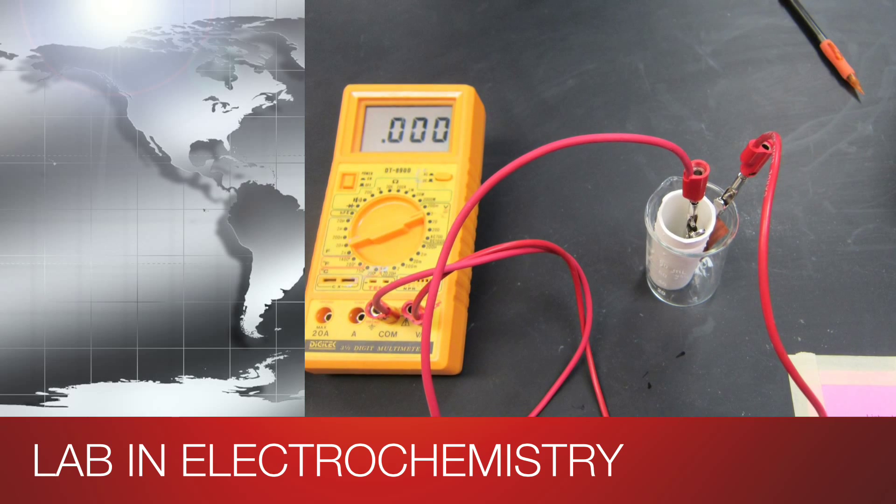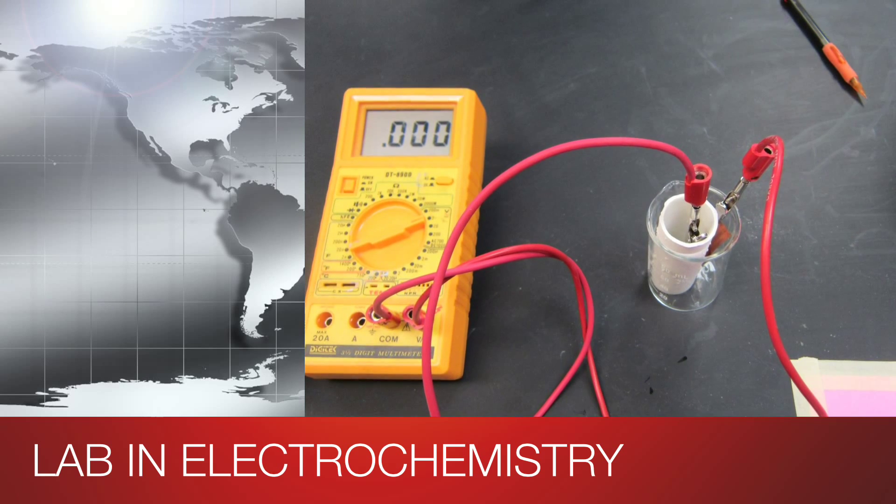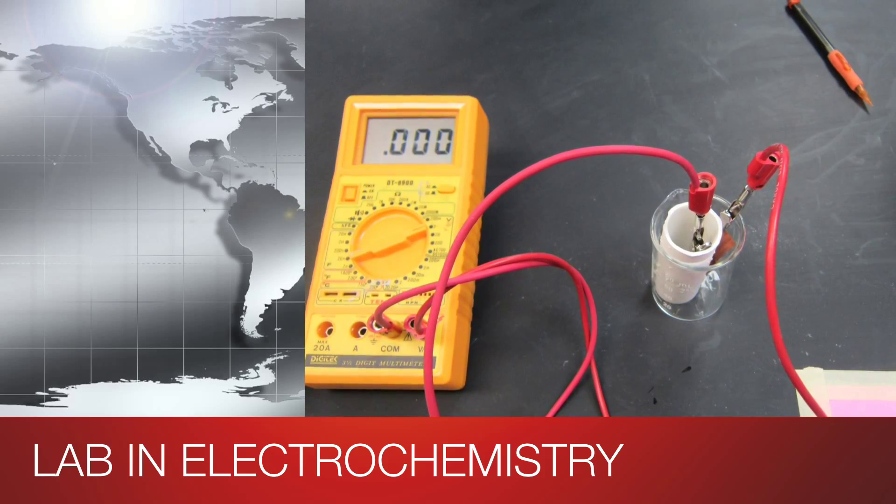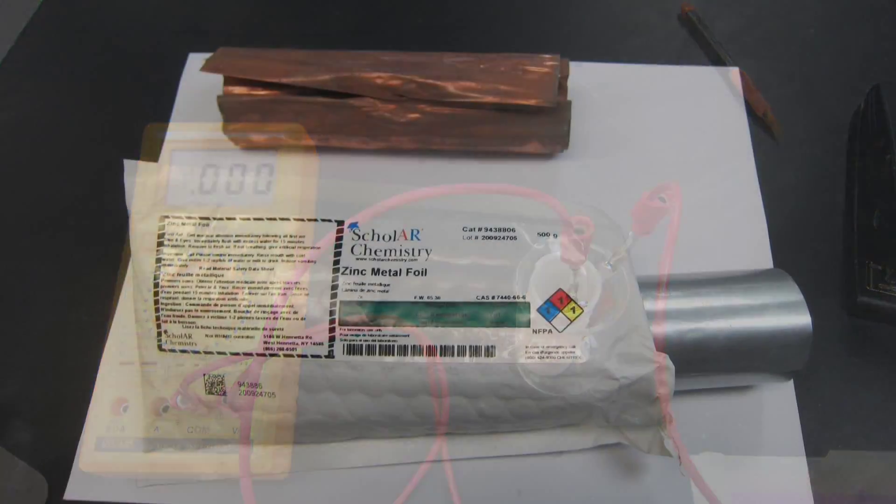What I am going to show you today is how to set up an electrochemical cell, namely a galvanic cell, to measure the variation of EMF with changing concentration.